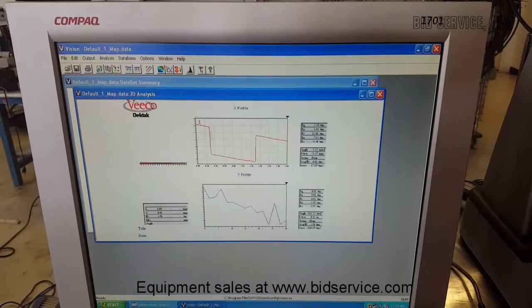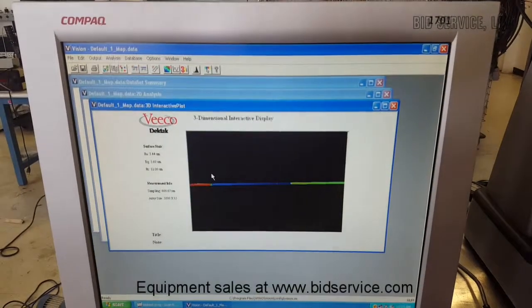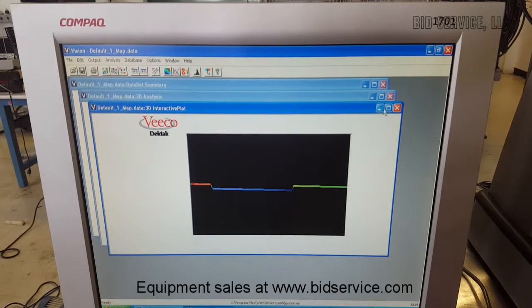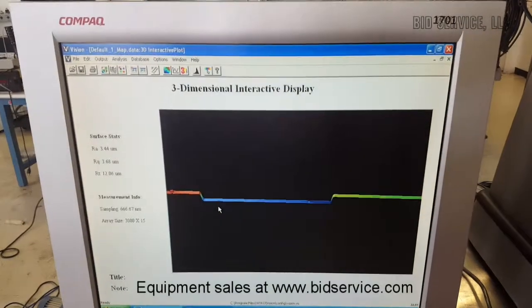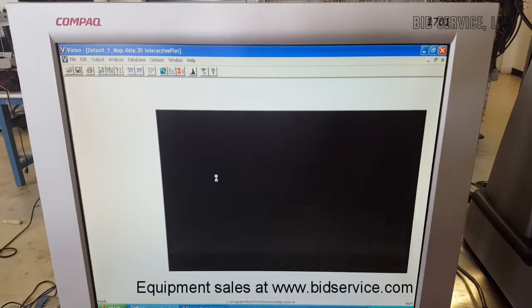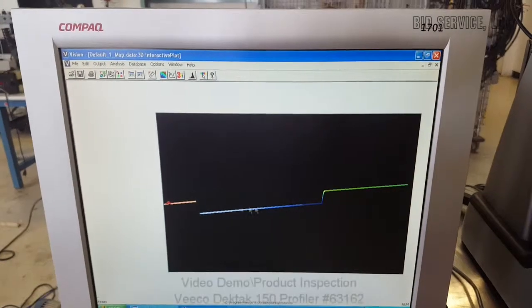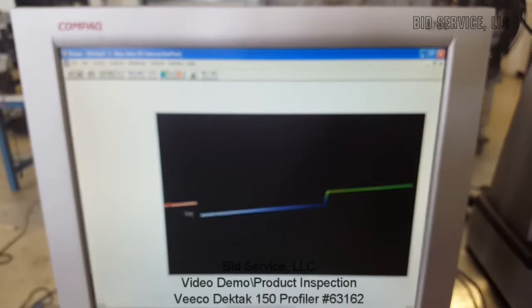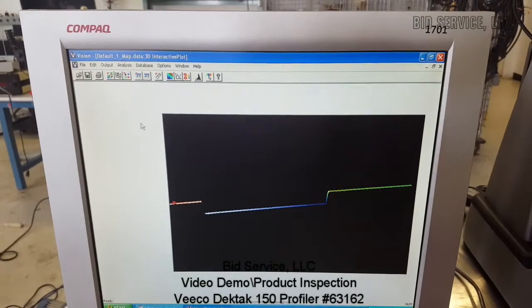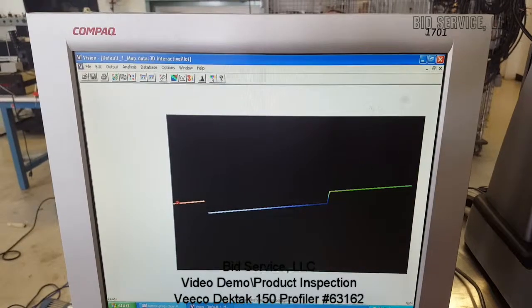So this is a 2D profile. You can also go to 3D interactive, and as you move it around, you can see the different parts of the image. This will complete the video demonstration of the DECTEC 150. Thank you.